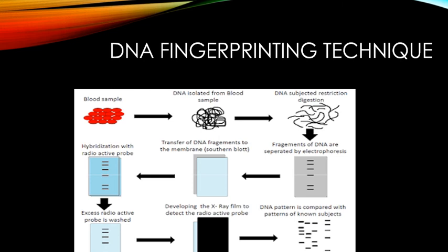After that, we are going to develop X-ray film to detect the radioactivity, and this will allow us to visualize the patterns of the DNA, which is specific for each individual, and this is going to allow us to compare between the DNA of different individuals.